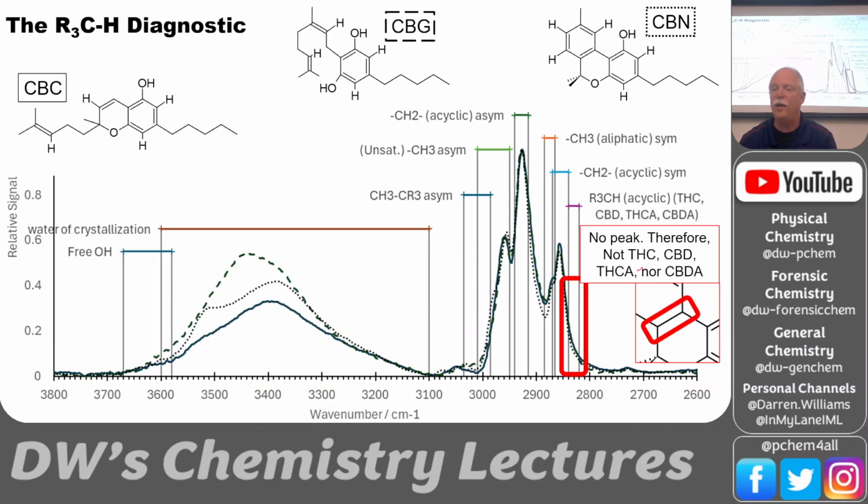So that'd be very helpful. I don't know the psychoactive properties of these three, but if the law is focused on THC and I recrystallize whatever these things are and I look at it in the infrared and I don't see that shoulder, it's not THC. So it's not illegal, at least until laws are written for CBN or something like that.